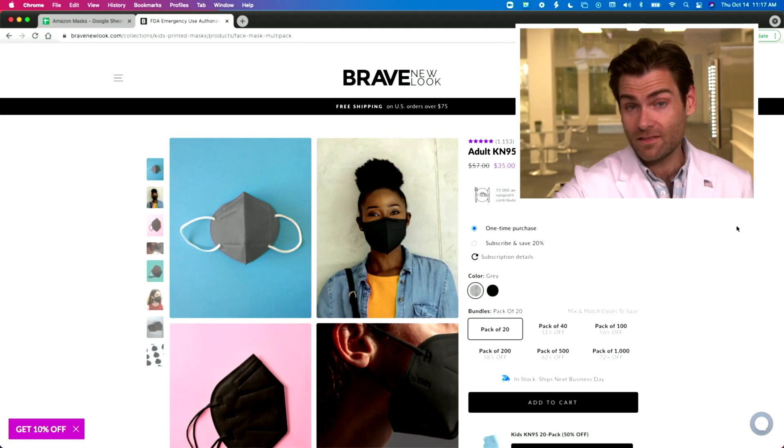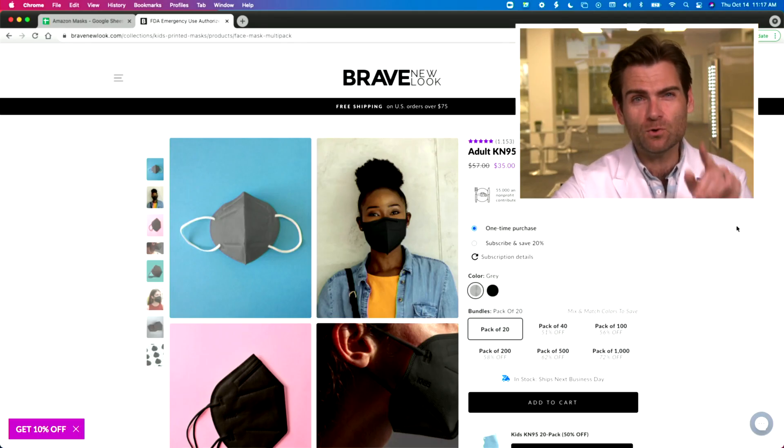Hey everyone, welcome back. Today we're testing the Brave New Look mask. You can be brave, you can be new, you can have a look — and apparently that has something to do with wearing a mask. That's the Brave New Look.